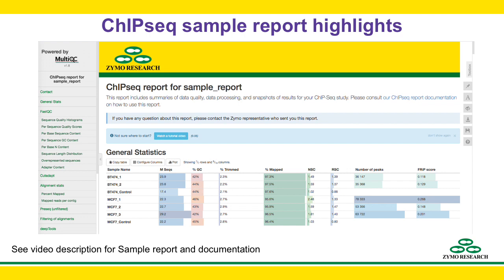In the second part of this video, I will show you some ChIP-seq results and how to interpret them. They are from an interactive, all-inclusive report that we provide to our customers. I strongly encourage you to check it out — it has more content and since it is interactive, you can play with it yourself. The links to the report and documentation are in the video description.